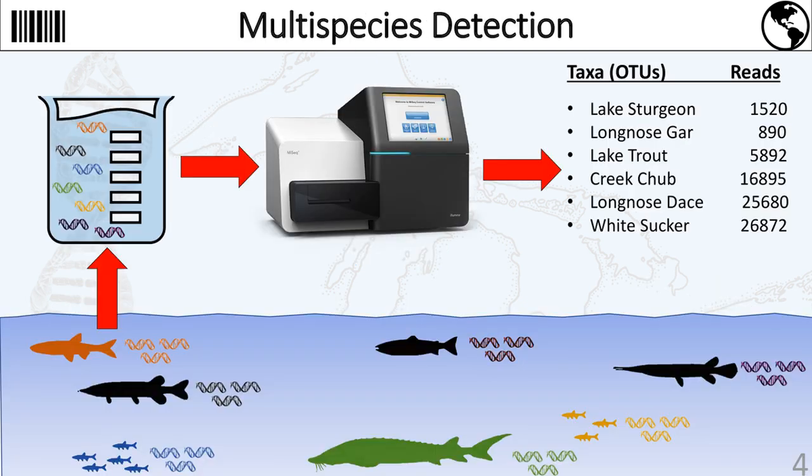Determining the distribution of species or their absence from a particular ecosystem is the bedrock for much of the species at risk monitoring regulations. The objectives of species at risk monitoring, or indeed other bellwether taxa, may be better served if multiple species can be determined to occupy a site of interest simultaneously. With metabarcoding, presence or absence data can be generated for myriad species from across a broad array of taxonomic categories, and all potentially from a single sample. Thus, the costs associated with targeted species monitoring may be more efficiently repackaged if multiple taxa be screened in a single surveillance program. Making this data available can help drive policy directions at the regulatory level, so metabarcoding data may expedite the knowledge flow from the field to the policy desk, and thus aid in the formulation of biomonitoring regulations.